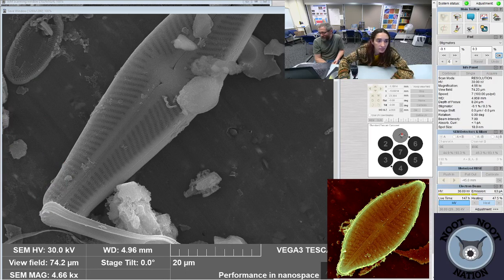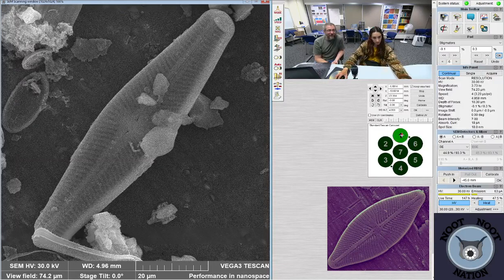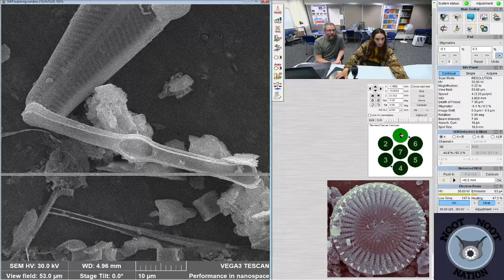And they ate themselves out of silica and crashed. Yeah, that happens quite a bit. And that actually happens occasionally in freshwater settings, where the other nutrients they need are really high. Many times they will consume the nutrients so quickly that they crash. But in the shallow areas, they still would be present because there's still a bunch of silica.